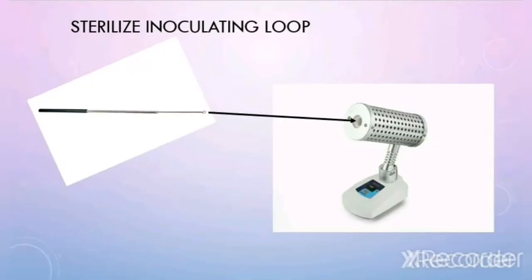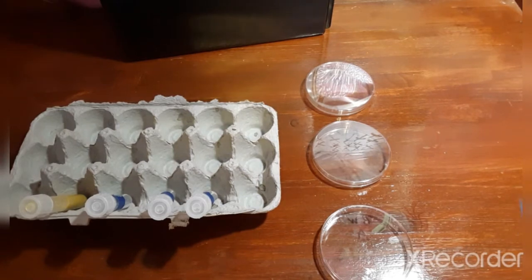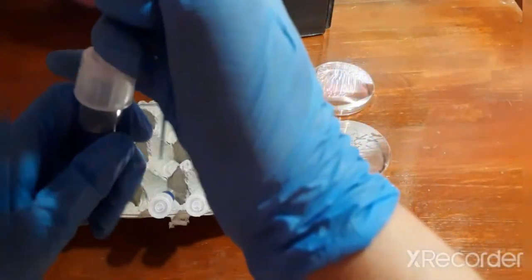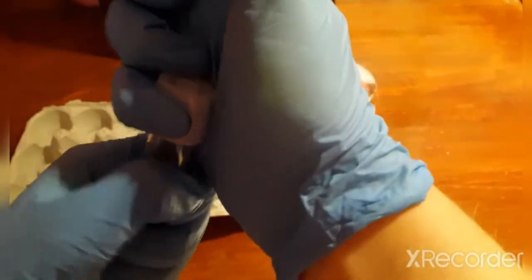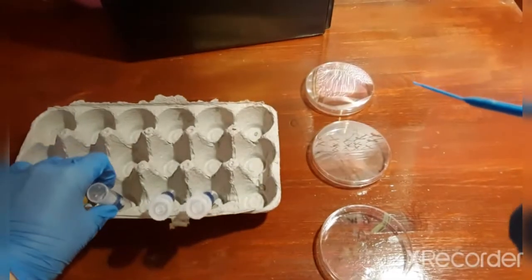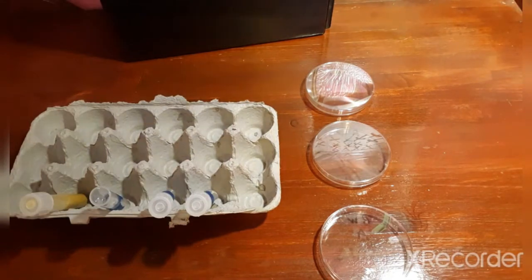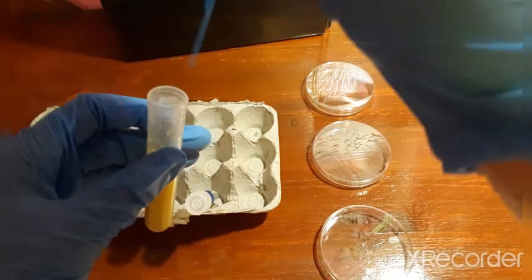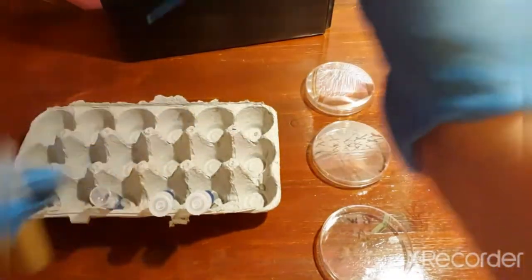Incinerate your loop using the Bunsen burner incinerator. Once you've done that, allow it to cool. You're going to transfer two loopfuls using your inoculating loop from your liquid stock culture into the deep labeled A. Take the cap off, pick up your liquid stock culture, and get two loopfuls — nothing more than that.